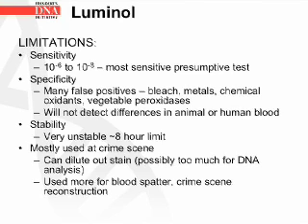Luminol is mostly used at crime scenes because it can dilute out a stain, possibly too much for DNA analysis. It is used more for blood spatter and crime scene reconstruction.